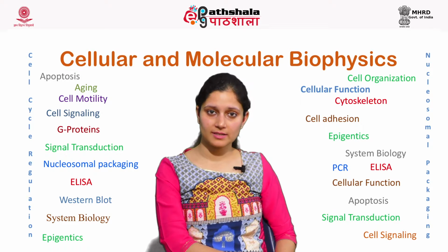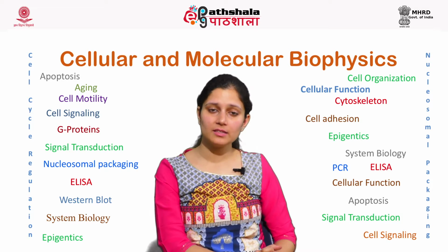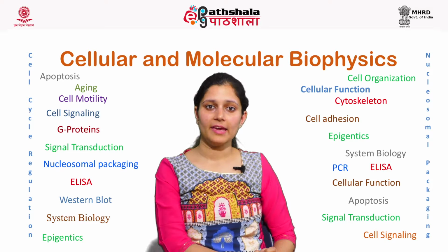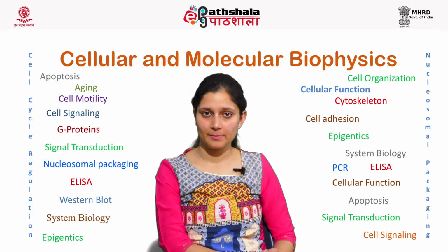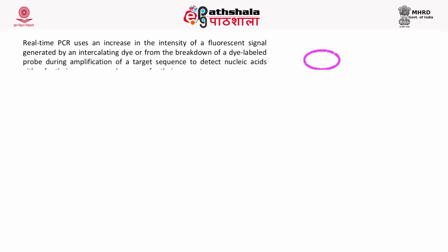There are some important terms in real-time PCR. Knowing the definition and understanding the importance of these terms helps in quantification of real-time PCR and in its measurements. Now, real-time PCR uses an increase in the intensity of a fluorescent signal generated by an intercalating dye or from the breakdown of a dye labeled probe during amplification of a target sequence to detect nucleic acids, either for the presence or absence or for their amount.